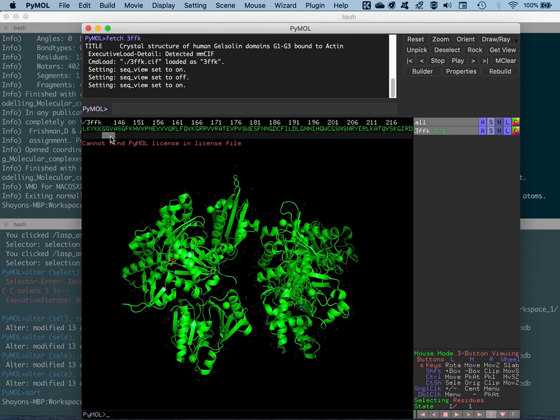file. Whereas in a generic PDB file it's difficult to retrieve the information, this is a special kind of file that we got from the PDB, which is obviously the asymmetric unit, but it also contains elements of the biological assembly, and the extension for this one is mmCIF. So if you do not provide an extension while doing a fetch command, then it will automatically take the mmCIF format, and that has this information on the missing residues, which you can see grayed out here.